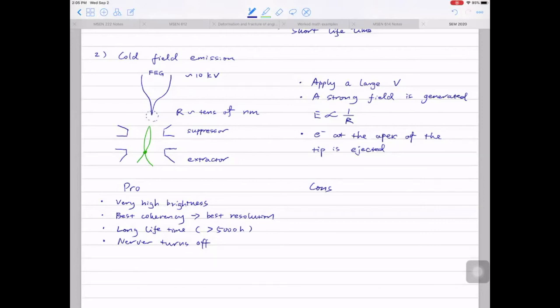So what happens if it loses power? In theory, there is a backup generator. In universities and many companies, especially if they have very expensive instruments, they never rely on the commercial power grid. They always have a backup generator. Whenever you lose power, the backup generator will kick in. Then you usually have 20 minutes to an hour, depending on what system you have, to manually turn off all the systems. Yeah, we had something like that happen where the backup power supply died.